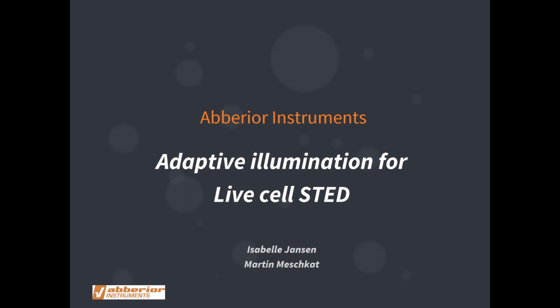Welcome to this webinar on adaptive illumination for live cell STED. My name is Martin, and together with my colleague Isabel, we will show you how to use techniques for saving light to obtain great live cell STED data.